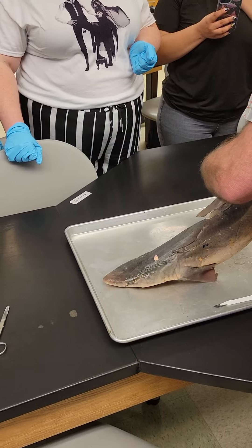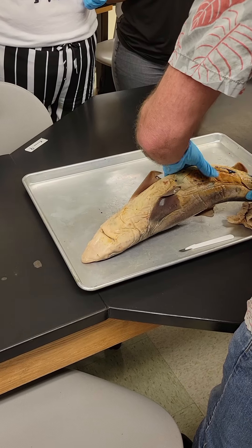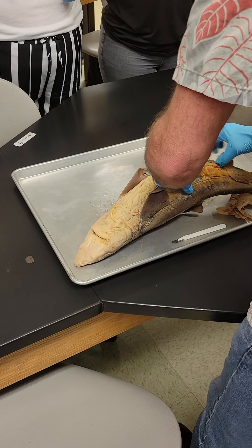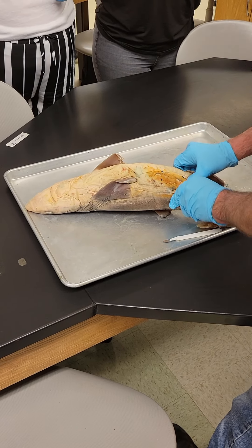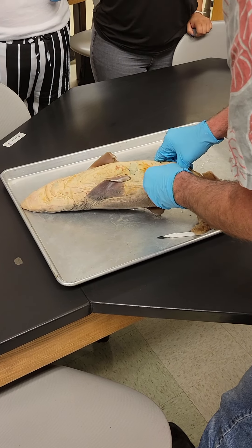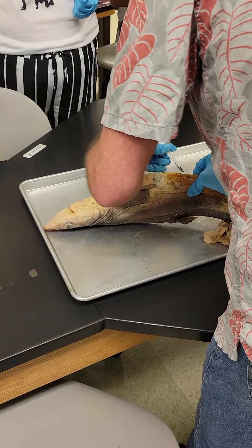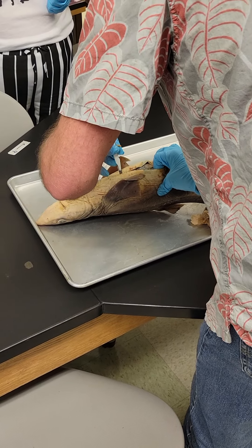We'll come back and look at the circulatory system — you can see the spinal cord there. Let's go ahead and cut it open. I think I can just tear it open. Sometimes I need to get pliers for this. Let's go ahead and just use the scalpel here. Make sure I don't cut anything inside.